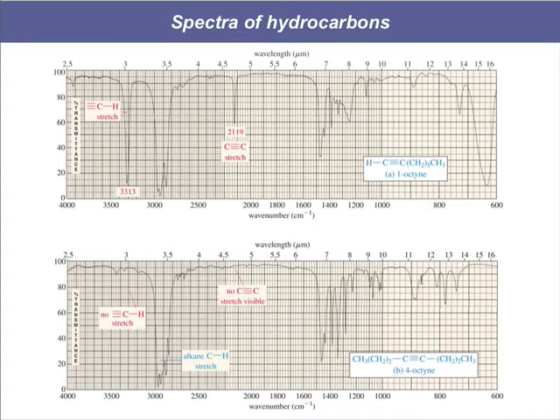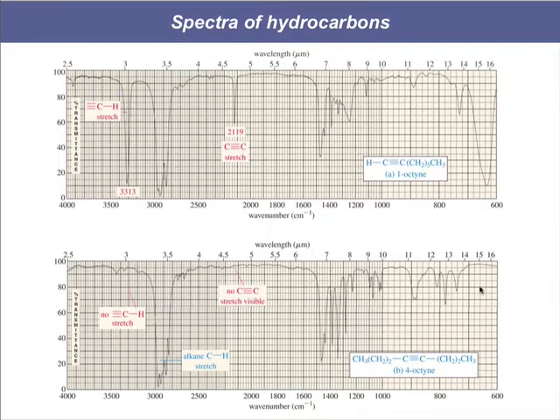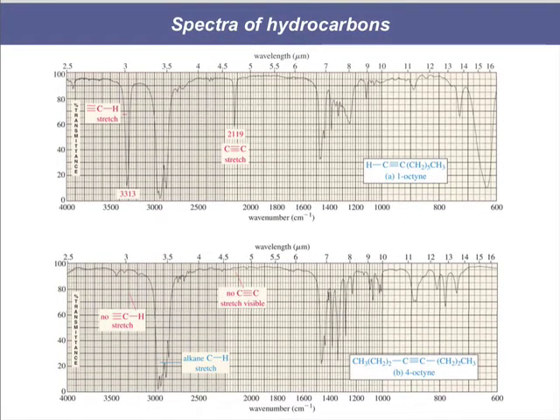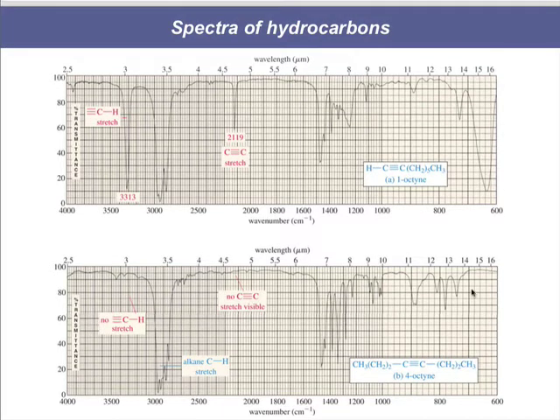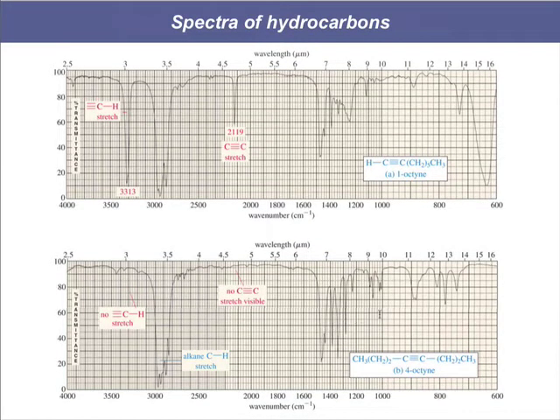So if you were to go and look up a reference for your spectrum, you think, okay, maybe I've got 4-octyne, and you look it up, the fingerprint regions should match. But you would not be able to tell that this is 4-octyne just by looking at its fingerprint region and nothing else. So that is a bit of a buyer beware, a caveat.